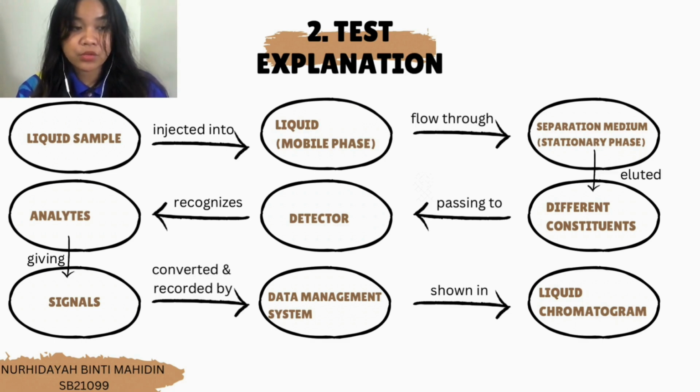Then it will pass through the detector. The detector will recognize the analytes, then give signals to the data management system. That means the signals will be converted and recorded by the data management system. Lastly, as the detector measures the amounts, it will form an output called a liquid chromatogram.